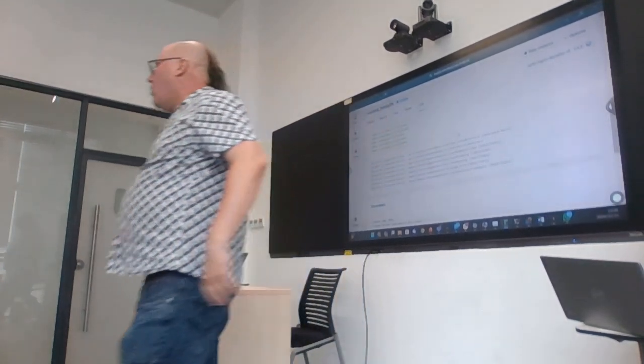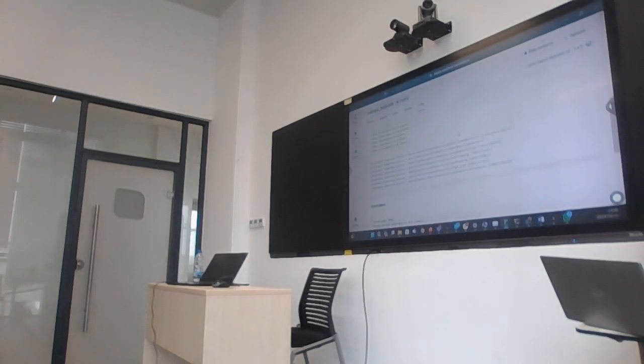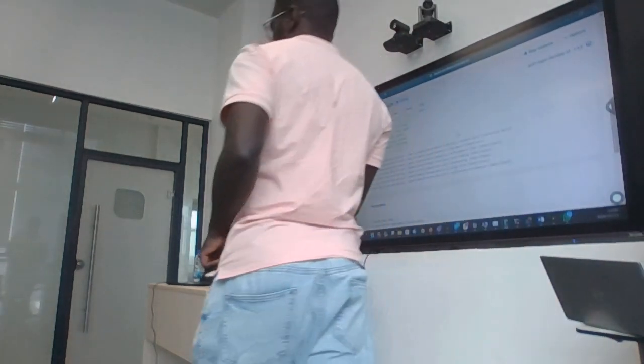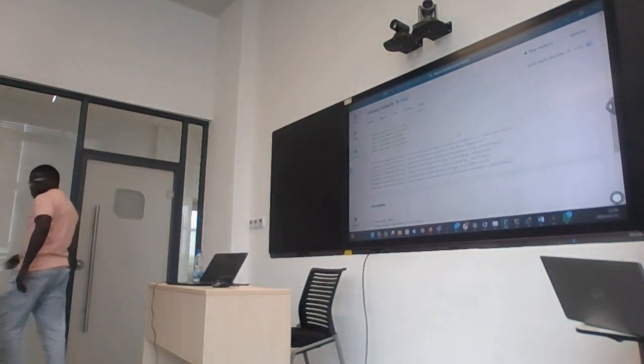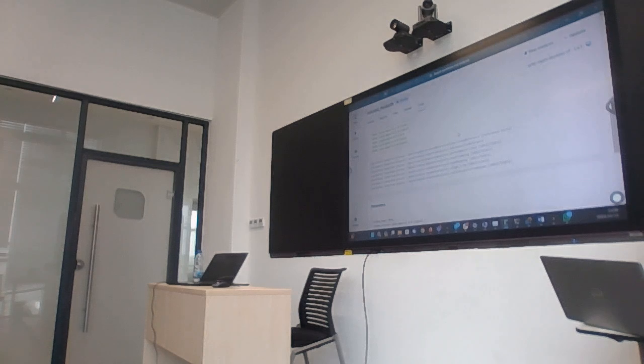Yours, there must be an error. Okay, yeah, up here. Unable to find anything. There's a problem there. Then this is the error: the file is unable to find this image. Pulling from hostile, died at the download.